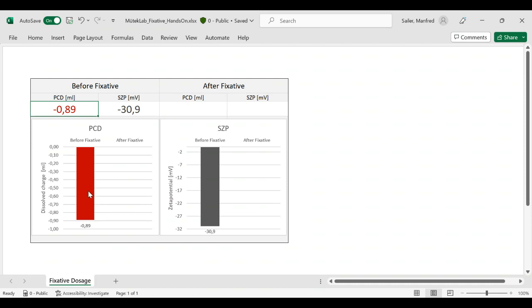So it is a smart thing to take care of this anionic charge here and to eliminate it by using a cationic fixative. Because once this thing here is taken care of, you are evening the way for the fiber additives to efficiently react on the fibers. And the fibers of our pulp suspension have a zeta potential of roughly -31 millivolt. So anionic fibers, happy and willing and ready to react with your cationic fiber additives.